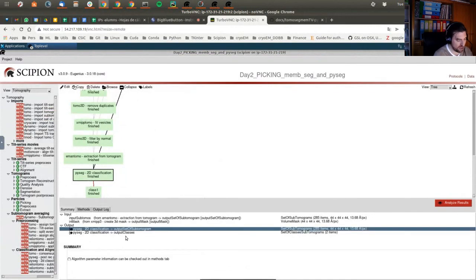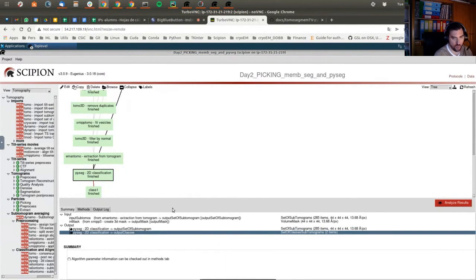They contain the information about which class they belong to. Normally, there are more classes than 2. For example, if we didn't perform the filter by normal, probably there would be 4 or 5.